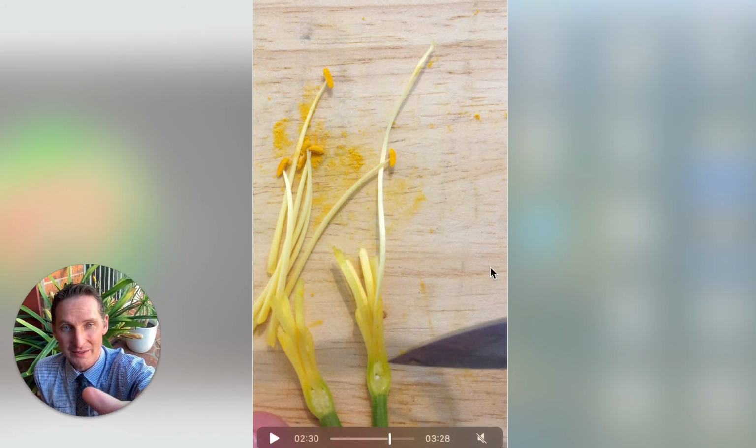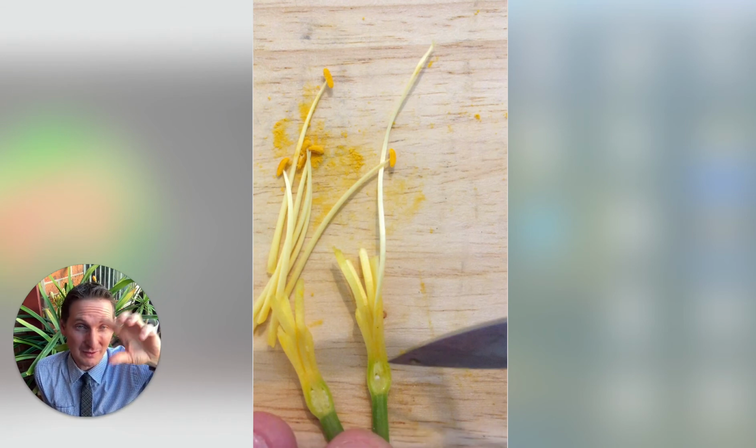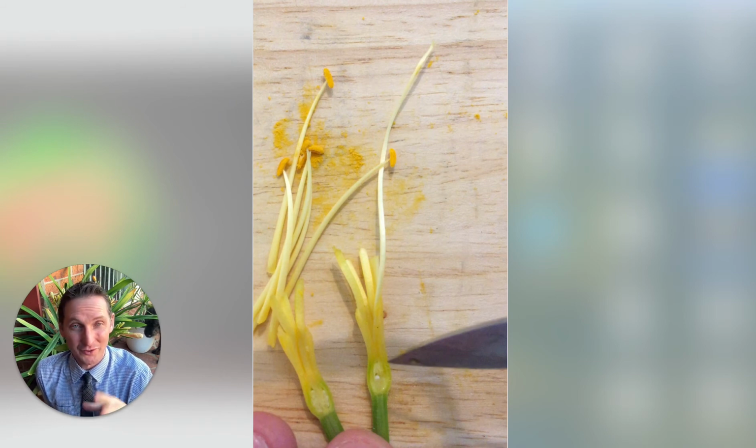All of that is the pistil, 1, 2, and 3, and all of this on the left-hand side, that's the stamen as well. And then you could probably put a petal in there on the side too. And then you're going to take a screenshot of the labeled image on your screen. Then you're going to upload that as well. So 2 photos: 1, a selfie just with the flower, and 2, after you've dissected it out and labeled all the parts that you've seen, and then upload a screenshot of that too.